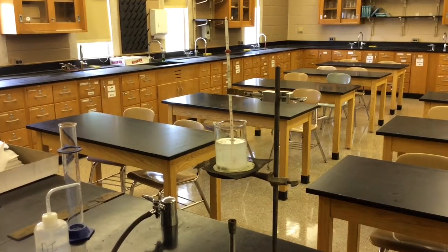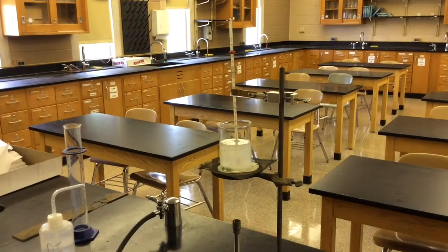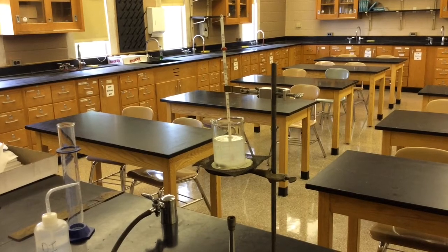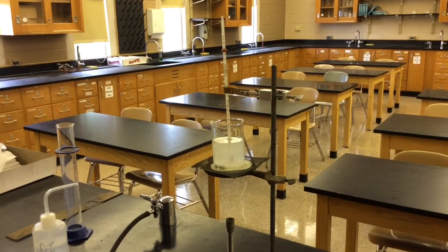And then if you're doing another run, turn off the gas again and add more water to bring the level of the water back up, add more salt. That's only if you're doing another run. At that point, you have all your data, let this cool, and you can start going over the material on the back, making the graph and answering the questions. But that is the setup.